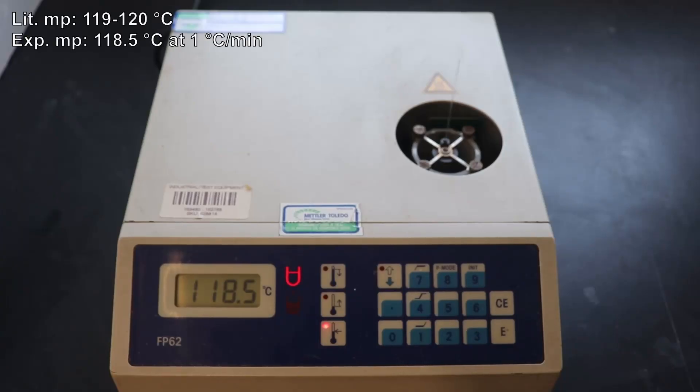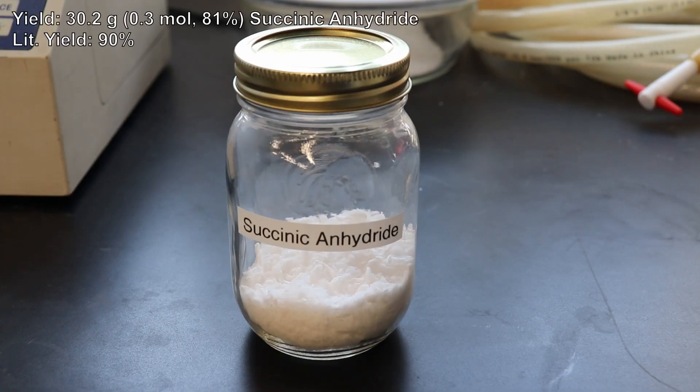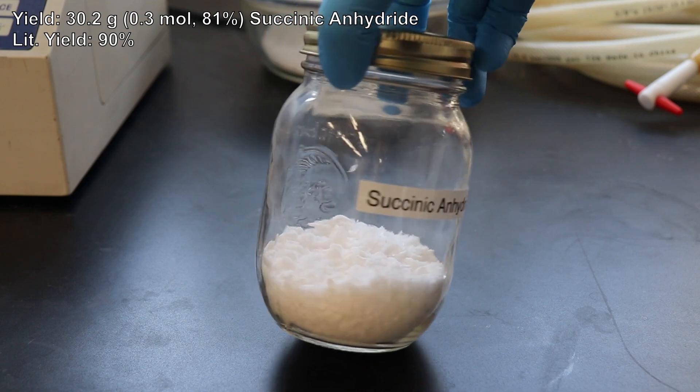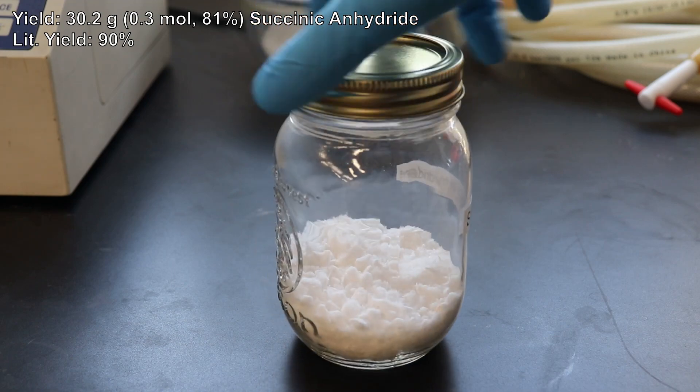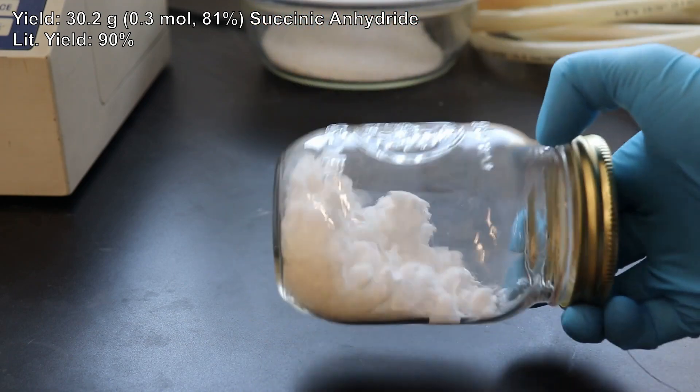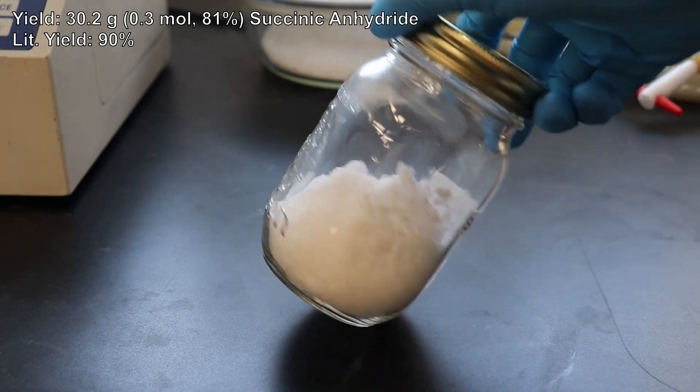The literature melting point of succinic anhydride is 119 to 120 degrees Celsius. I ended up with a melting point of 118.5 degrees Celsius which when rounded is perfect. I ended up with 30.2 grams of succinic anhydride which corresponds to an 81% yield, and compared to the literature yield of 90% this is pretty good.